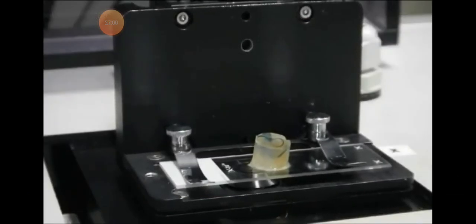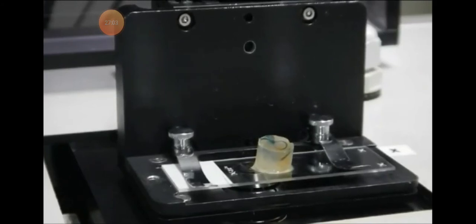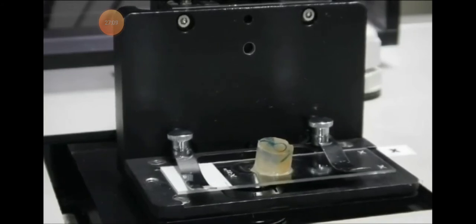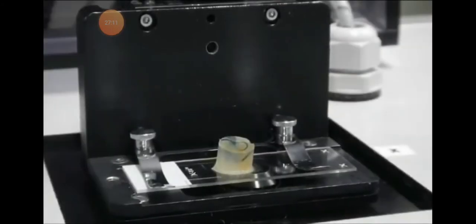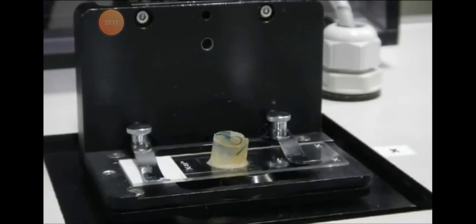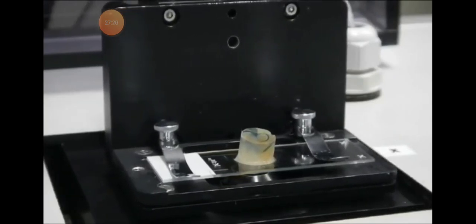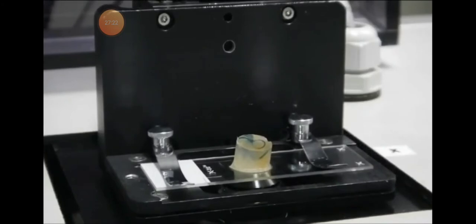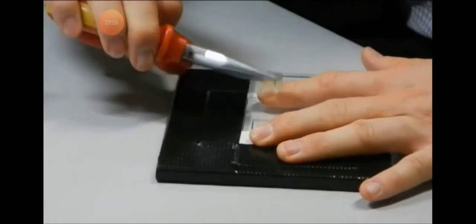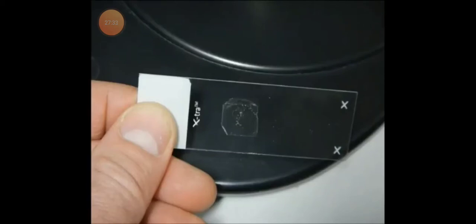Cutting time for a sample of the size depicted being approximately 3 minutes. This time may be used for the preparation of the next cut, the documentation of samples, or the setting out of histological stains. After the cutting process has been completed, the sample may be removed from the microtome. So this is a laser microtome. Working of a laser microtome. The sample is now separated from the section with the aid of pliers. The section remains attached to the slide and may now be stained or simply cover slipped as is, depending on the application in question. Several methods for staining embedded sections have been established for use here.